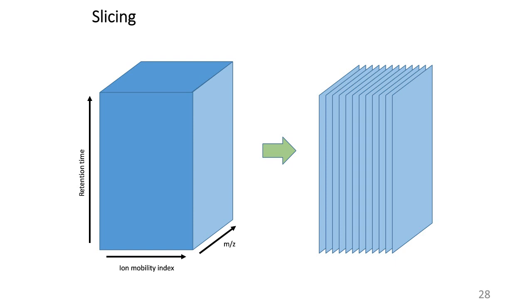For example, in fMRI data, one would have already developed object recognition algorithms for this kind of 3+1 dimensional data. However, our concern is not only to do good feature detection, but also to do this in a timely manner, meaning in a way that is highly performant in terms of computation and leads to an answer in an acceptable time for the user. So we try to use any regularities in the data to simplify the algorithms, and to use algorithms that are as simple as possible, but not simpler, as the speaker before me said. That's actually a very good strategy to address this problem.